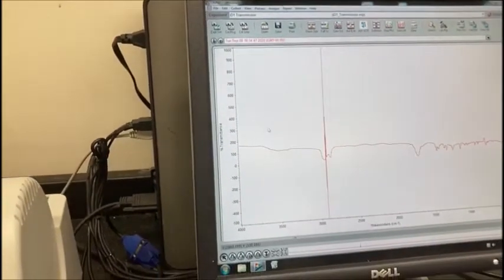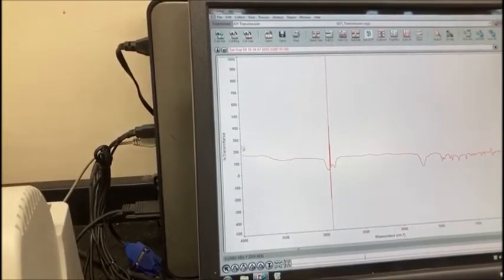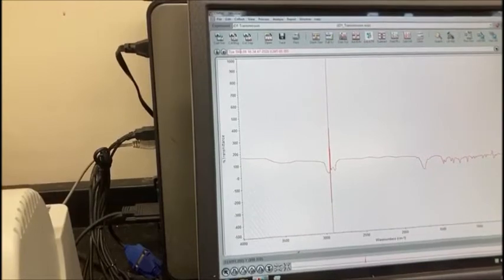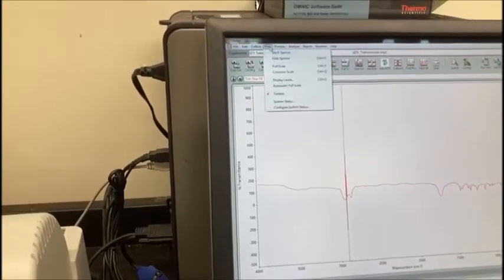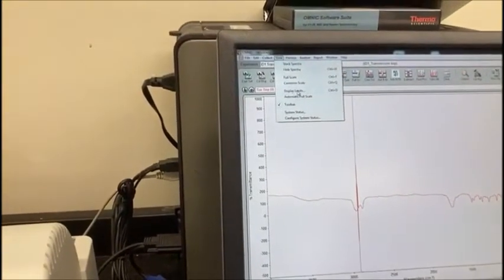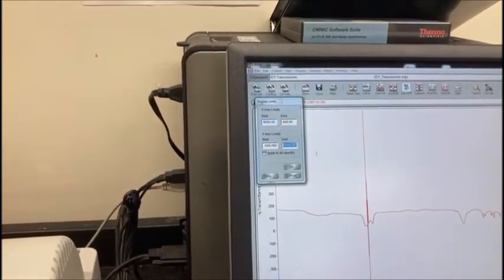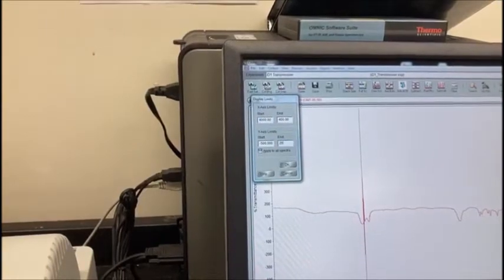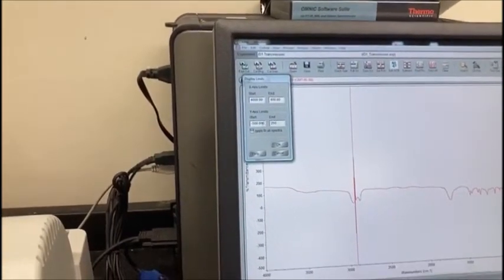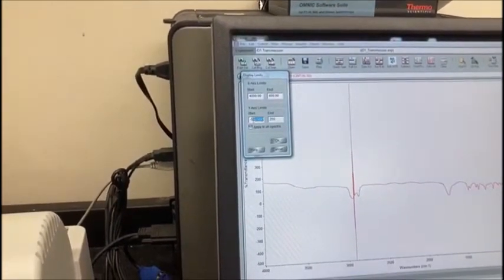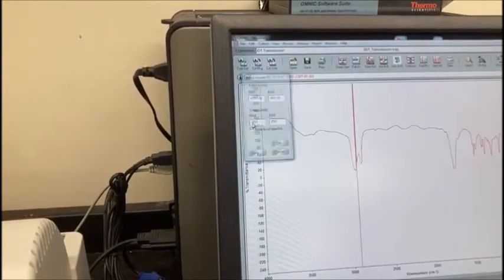Okay, we're starting to look a little bit better. We'll probably cut it now at maybe 250. Basically you just want to zoom in until you actually see a good spectra. We don't even need to go down to negative 500, we can go down to negative 250.